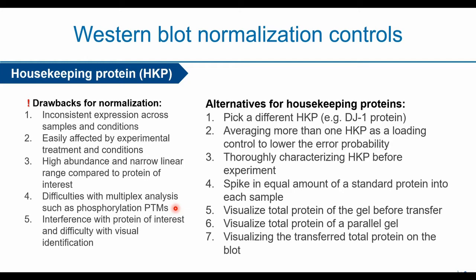So for those who do post-translational modification studies, I will highly recommend you go for the fluorescence method if you can, if you have such equipment or capability. This will save you a lot of time and help you control a lot of situations as well.